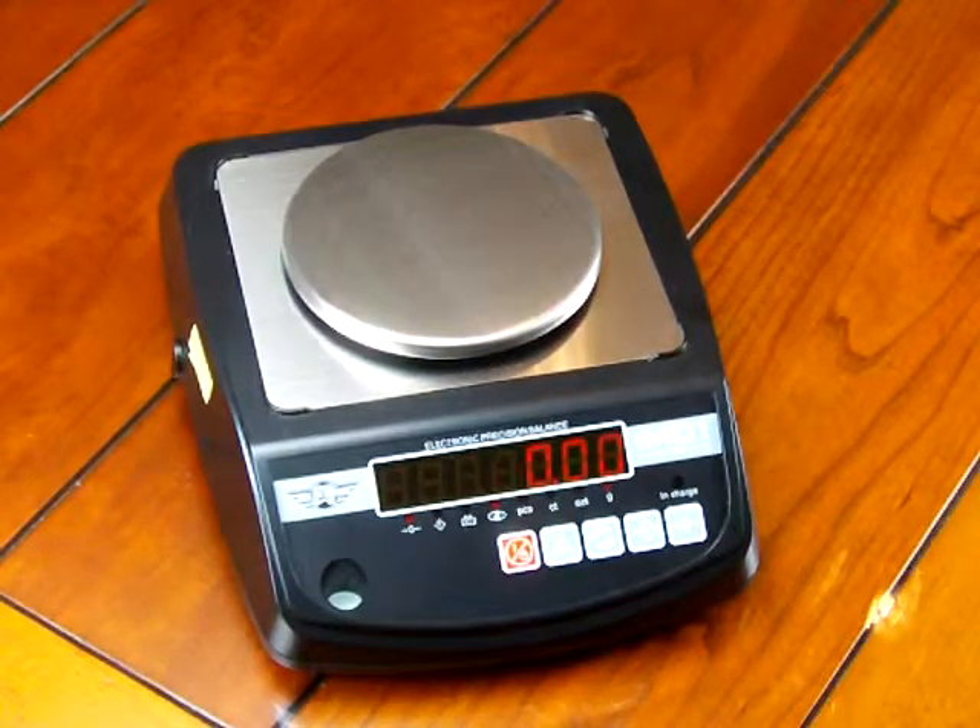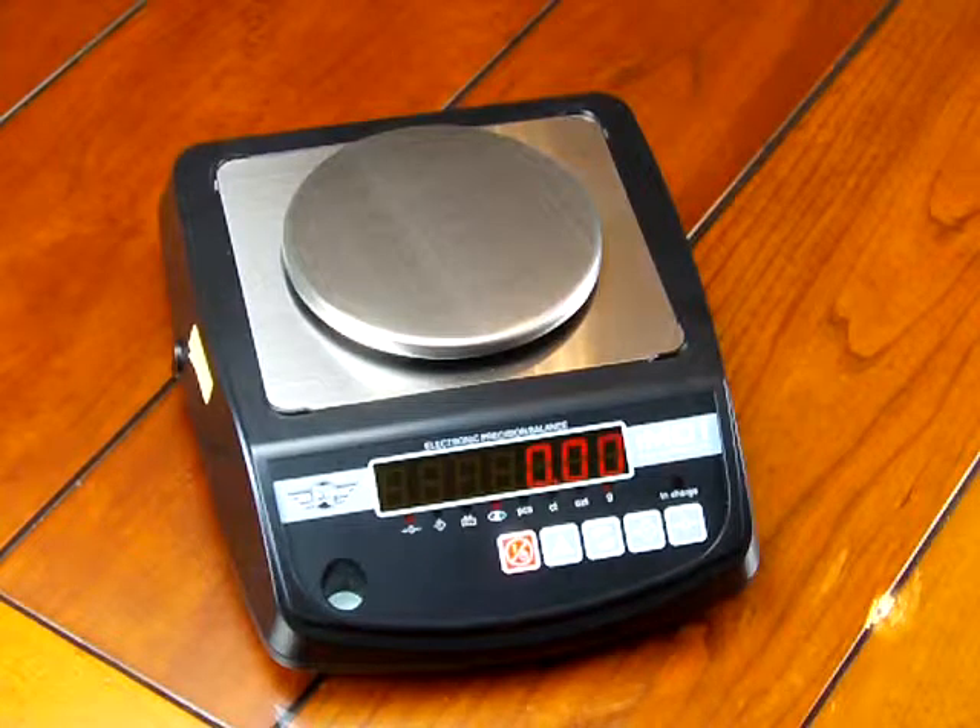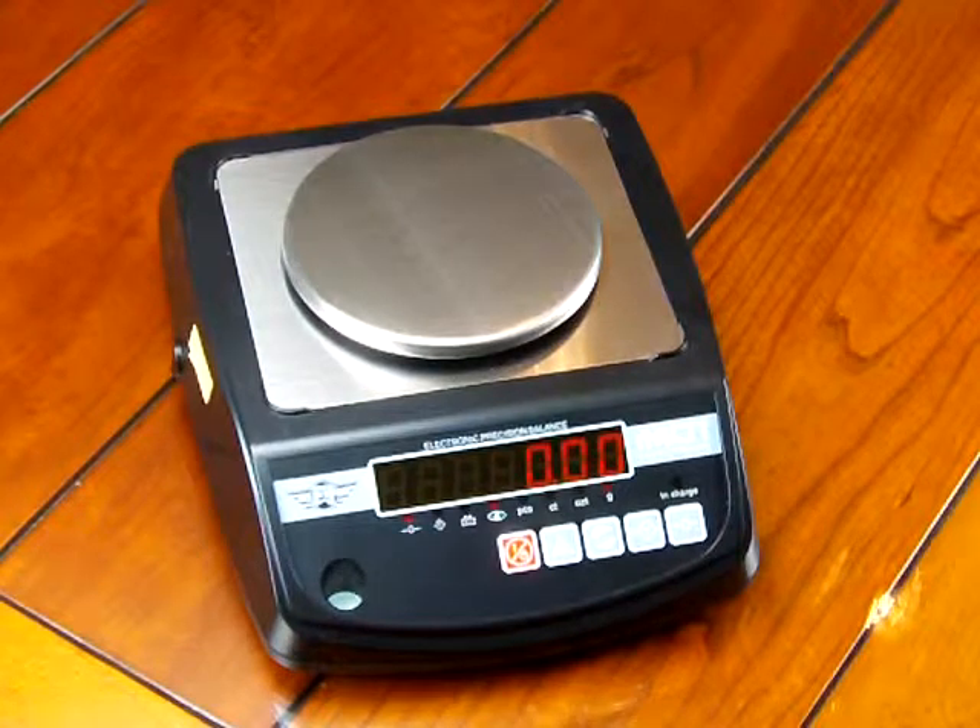In this video we'd like to demonstrate the MyWay IM01. This scale offers 1,000 gram weighing capacity in increments of 0.01 grams, so it increments in two decimal places in grams. The MyWay IM01 is a great affordable scale for someone looking for a hundredth of a gram readability.